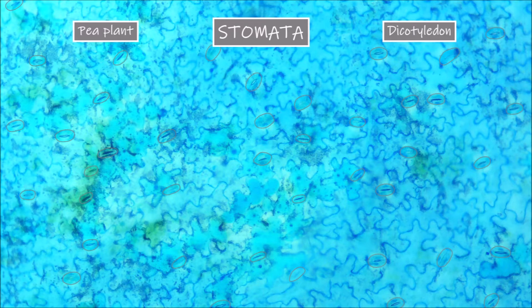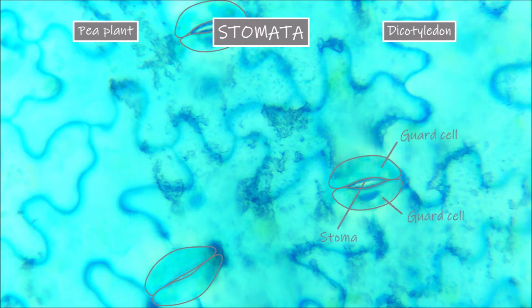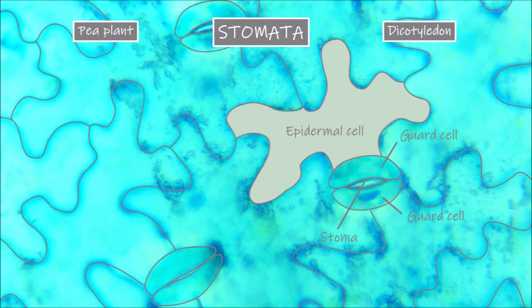These are where the stomata are, as you can see there are a lot of them. Now if we go to a higher magnification you can see them more clearly. What we are seeing mostly are the two guard cells that surround the stoma. The stoma is the pore found between these two guard cells. These two guard cells are what we call kidney shaped. We can also see that the stoma or pore between these two guard cells is open. In addition to the specialized guard cells and the stoma we can see the layer of irregular epidermal cells that cover the surface of the leaf.